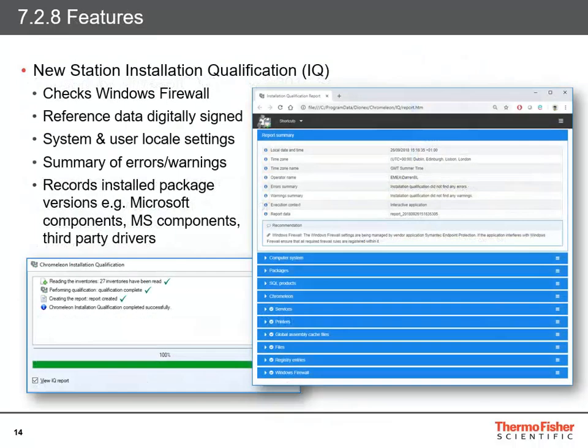Chromeleon 7.2.8 also introduces a completely new Station Installation Qualification. The StationIQ tool has been rewritten from the ground up to support extensibility and enhanced checking in an easy-to-read format. The StationIQ now checks Windows firewall rules — or, when a third-party firewall is used, shows a recommendation to check those rules. The reference data for the IQ is now digitally signed to prevent manipulation, and the StationIQ records system and user locale settings such as number and date formats. On the IQ report, a summary of any errors and warnings is shown at the top, with entries linked to the corresponding section of the report containing further details. It also adds a packages section reporting on the version of packages installed with Chromeleon, such as Microsoft components, mass spectrometry components, and third-party drivers, and checks that the expected versions are installed.